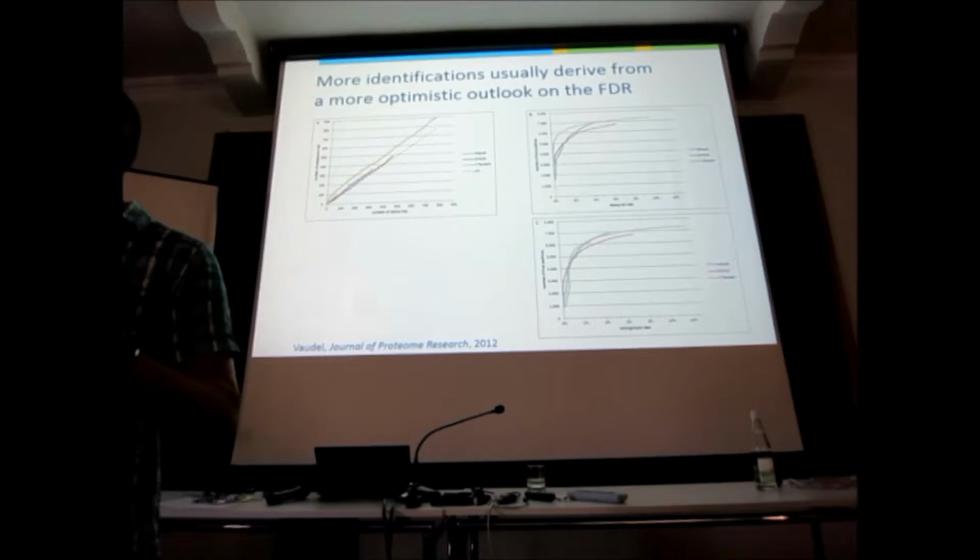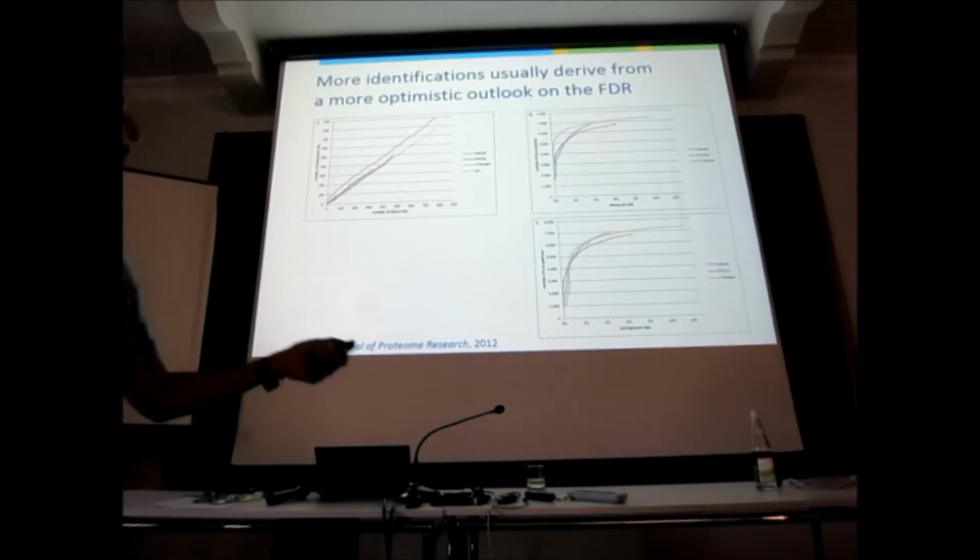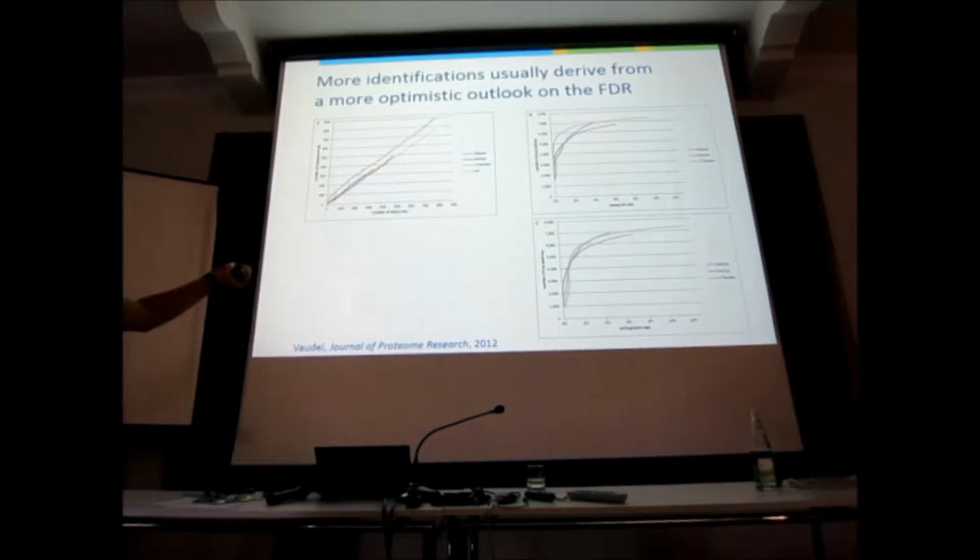Tandem is underestimating the FDR. It's telling us, based on target decoy, that you have 200 crap hits, but in fact, when we try it on something else, we get 300 crap hits. That's a 50% increase, right? Now, this translates, if you look at the decoy hits that you get from Tandem, into more good hits.